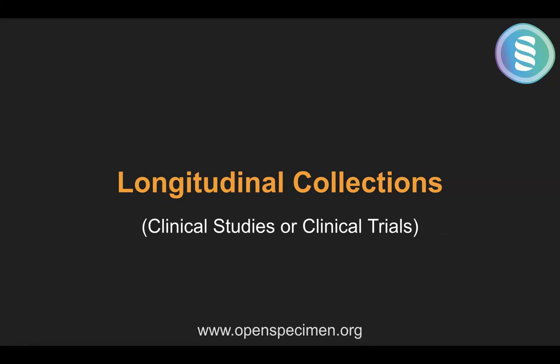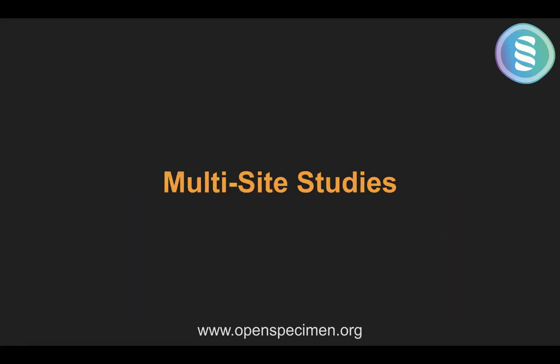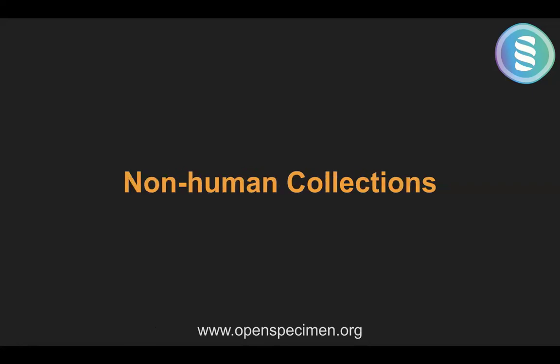And what are you going to do with those specimens once you collect them? You can actually design the study calendar in OpenSpecimen. We also support multi-site studies. That is, many of our customers run studies across multiple sites in the US or even internationally, and all the specimens come to a central location, and then they are stored locally or at the sites. That whole process of managing a multi-site study can be managed within OpenSpecimen.